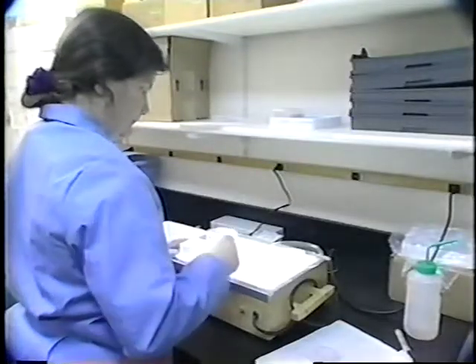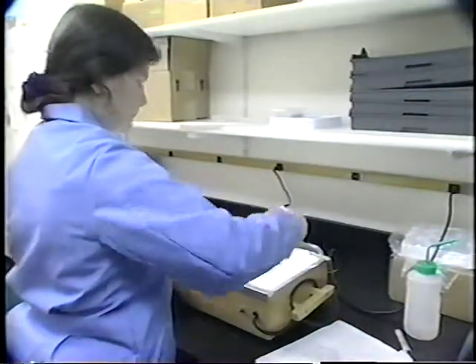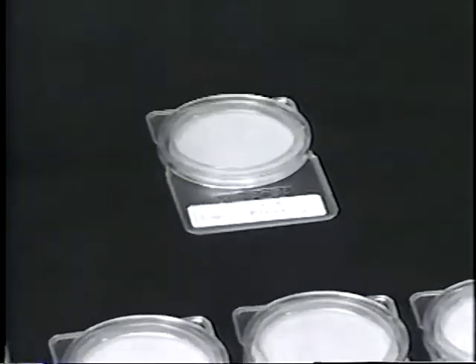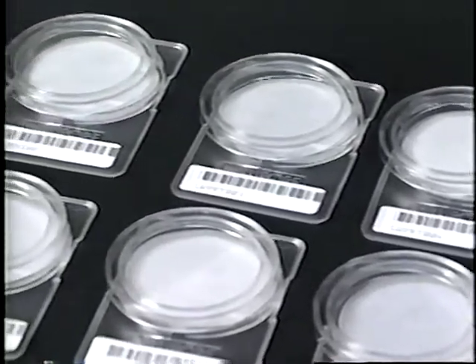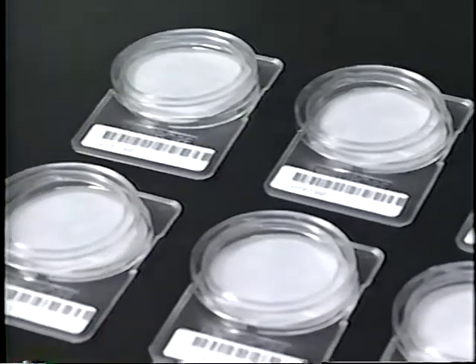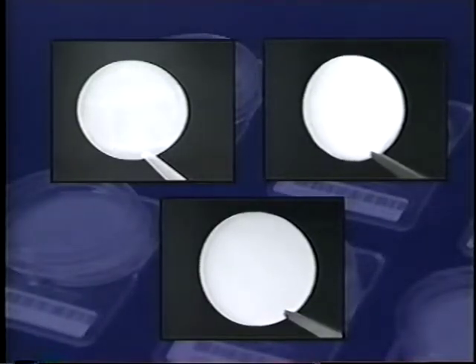Prior to being assigned a filter ID, filters should also be individually examined for physical defects. In addition to lab blanks, field blanks should be designated and handled as normal samples. About 10% of all samples should be so designated. In addition to acceptance testing, a few of the commonly used filters require specific pre-treatment prior to sampling. Let's take a closer look at 3 of these commonly used filters: Teflon membrane, quartz fiber, and nylon membrane filters.